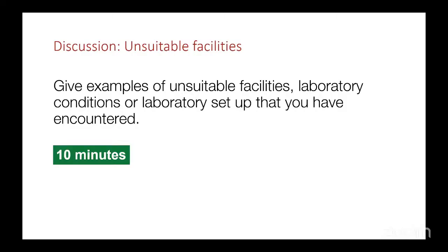Now, just write down. I want to talk about unsuitable facility. Give an example of an unsuitable facility, laboratory condition, or laboratory setup that you have encountered previously. I know some of us have a lot of experiences, a lot of laboratory setups that we have worked in that are unsuitable, from the environment to the design to the spacing to a lot of things.